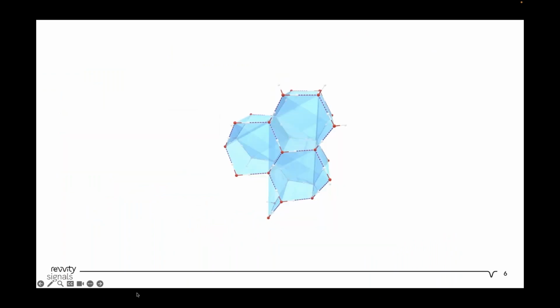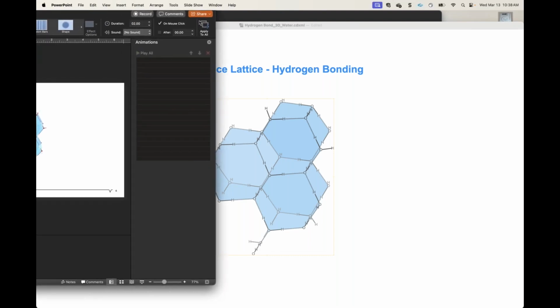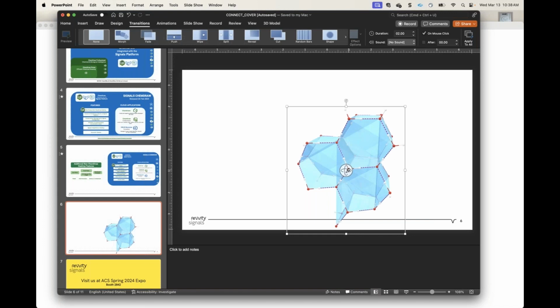If I go to my next slide, I have now this really nice, and I'll come out of presentation format so that we can now see, whoops, my 3MF rendering here. So let's make that a little bit bigger.